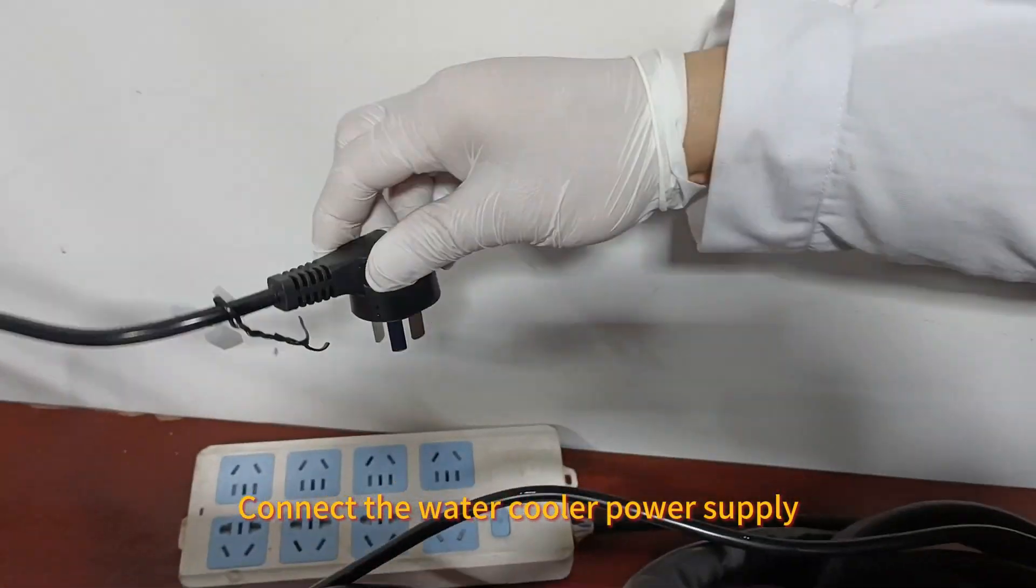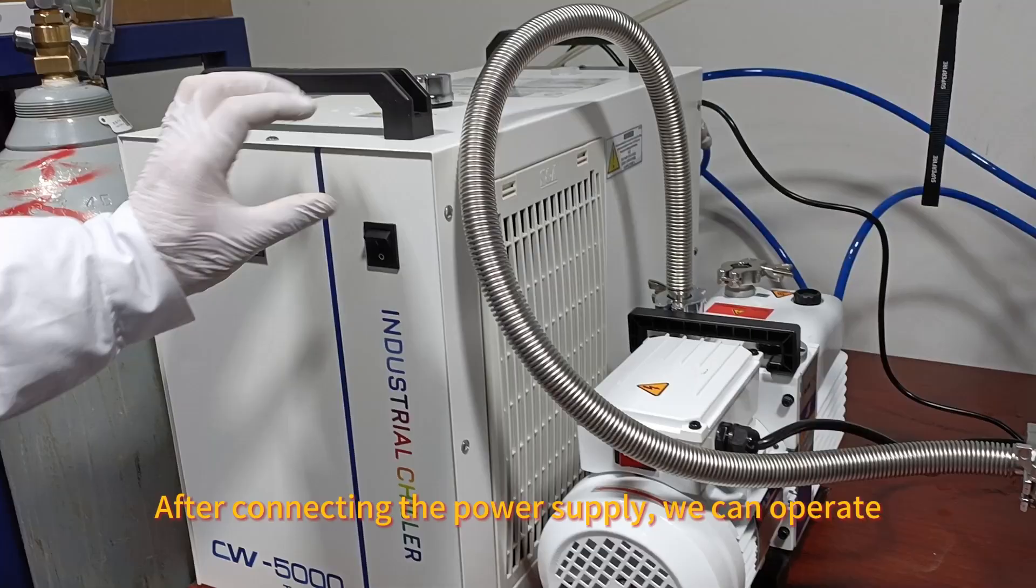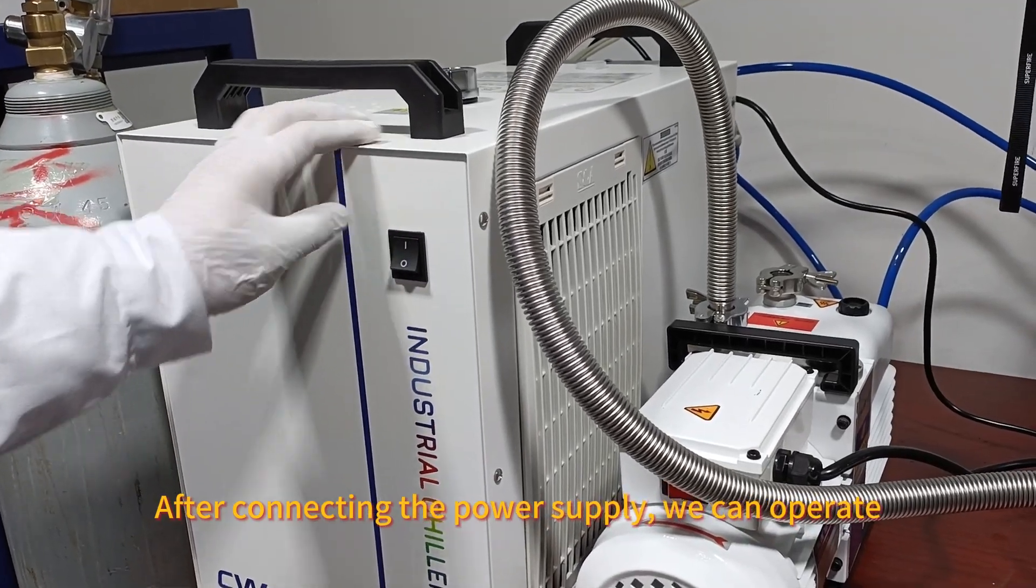Connect the water cooler power supply. Connect the power supply to the vacuum pump. After connecting the power supply, we can operate.